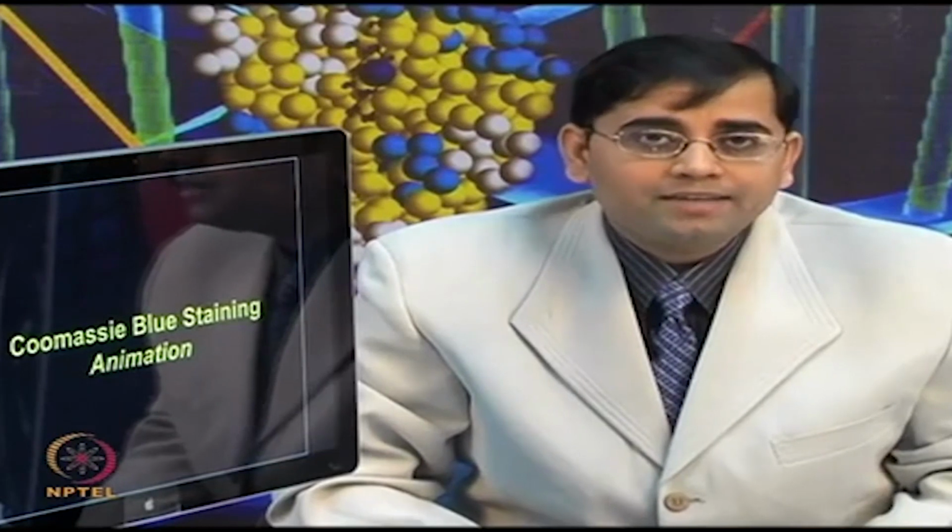So, most of the time, if you are lucky and if your protein extraction protocol is good, you have good protein yield, but often your samples are very challenging. Despite your good extraction protocol and your good laboratory skill, still you are unable to obtain a very good protein quantity. So, how to move forward?